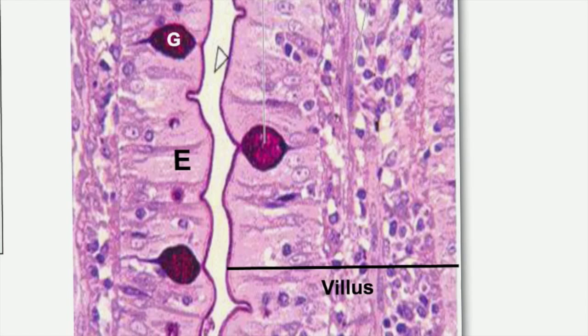This is the coat. Here we have the connective tissue core, full of the cells. Also we have sections in capillaries or in lymph vessel, the lacteal. Also we have this smooth muscle, spindle with central oval nucleus. Suggest what is the function of these smooth muscle fibers. These smooth muscle fibers can control the length of the villus.